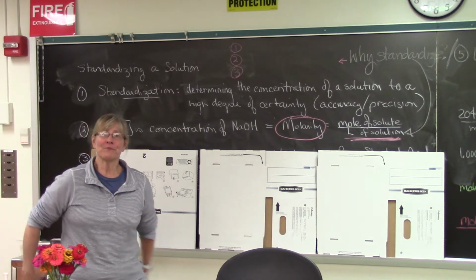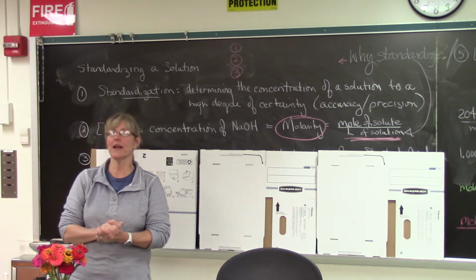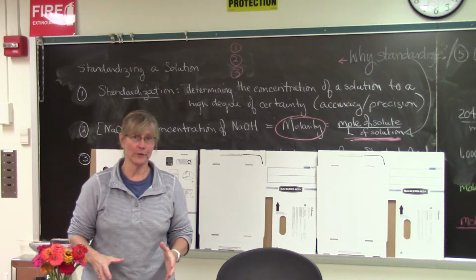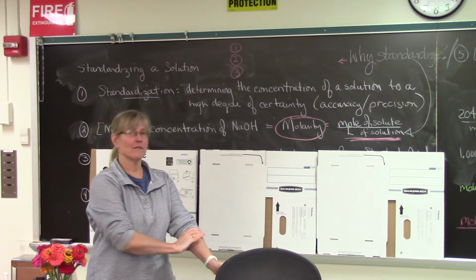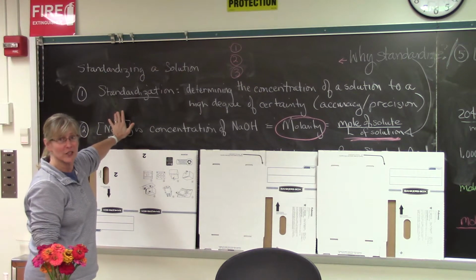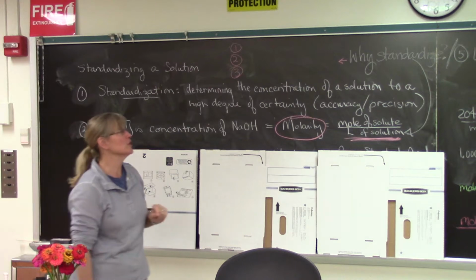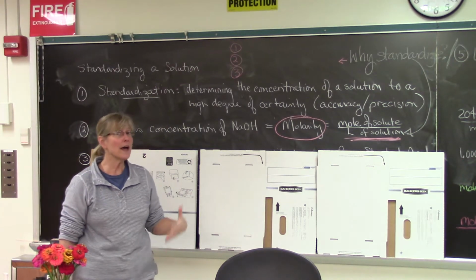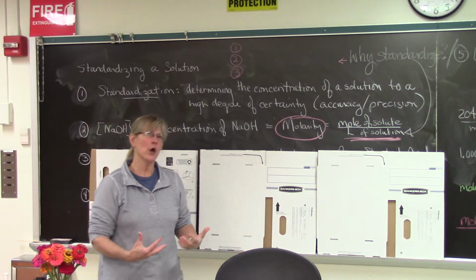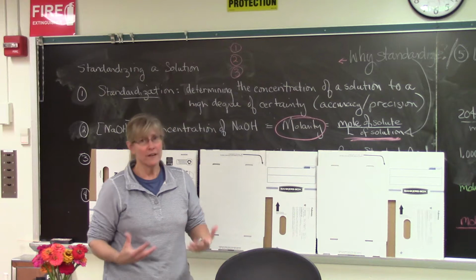Good afternoon. Okay, so the week of October 12th, that's where we're headed for now. We're going to be doing the standardization of a solution via titration. Okay, so first of all, what is standardization? Standardization is determining the concentration of a solution to a high degree of certainty. In other words, we really know the accuracy and we really know the precision very well.